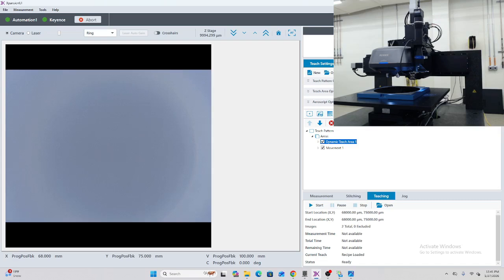So let's take a look at the user interface here on the screen. Here, I've already set up a recipe for this whole process. Normally in this area, what you would see traditionally is a long list of prescribed measurement locations that have to be predefined by the user to drive the microscope to. In this case, we've actually replaced all of that work with just two operations, one of which is simply a move to a load/unload position at the end, allowing me to change the wafers.